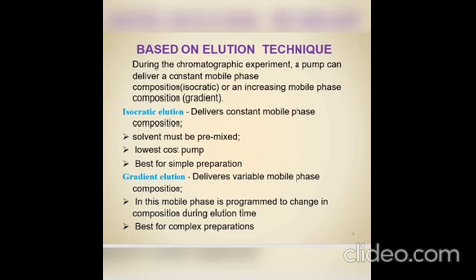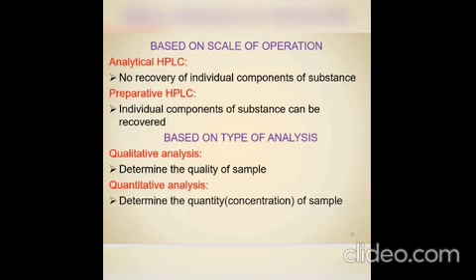Next, based on scale up operation, there are 2 types of HPLC, analytical HPLC and preparative HPLC. Based on type of analysis, there are qualitative analysis and quantitative analysis. Qualitative means just the detection will be there. Quantitative means detection and quantification will be there.